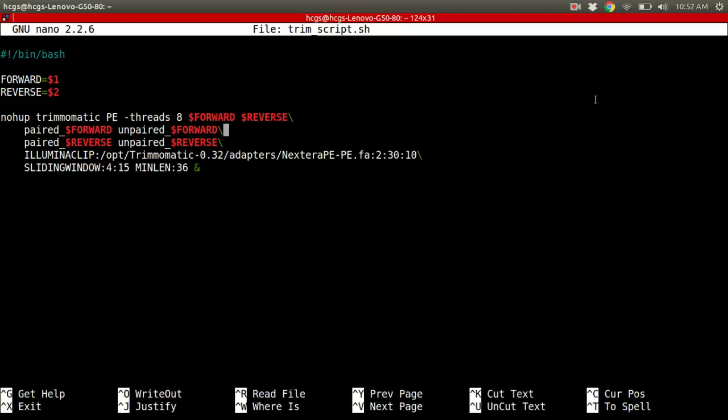So here's the second part of it. Now what Trimmomatic needs to take are the outputs of the paired and unpaired reads after trimming. Now these are going to be things that are created when this is done. And what's going on here is that based on your settings and filters, you might have to throw a read out because maybe it's really low quality or it's super small after you've trimmed it. In those cases, you throw out that read, but now its mate pair.